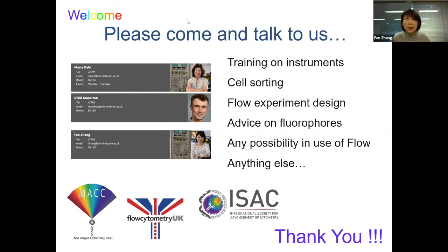So it subtracts a certain percentage of the signal that's spilled into the other one and corrects the signal just by subtraction. This is done automatically by the software.